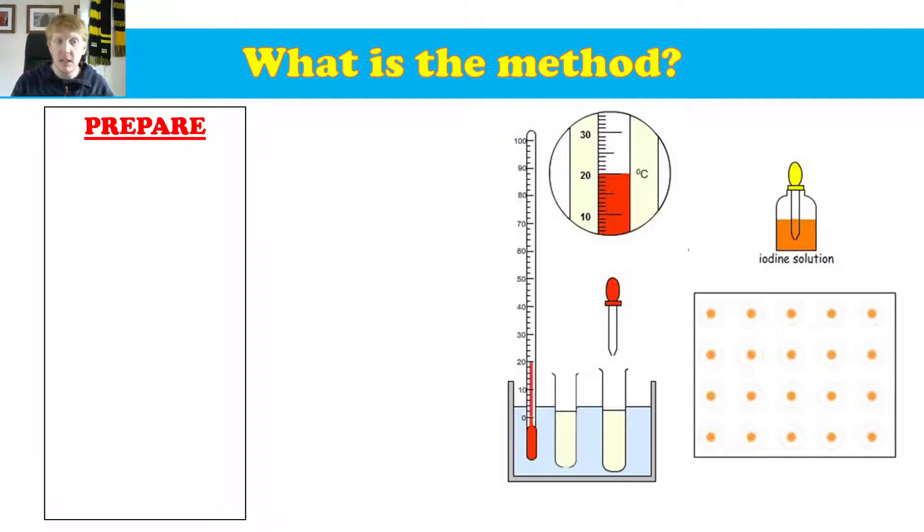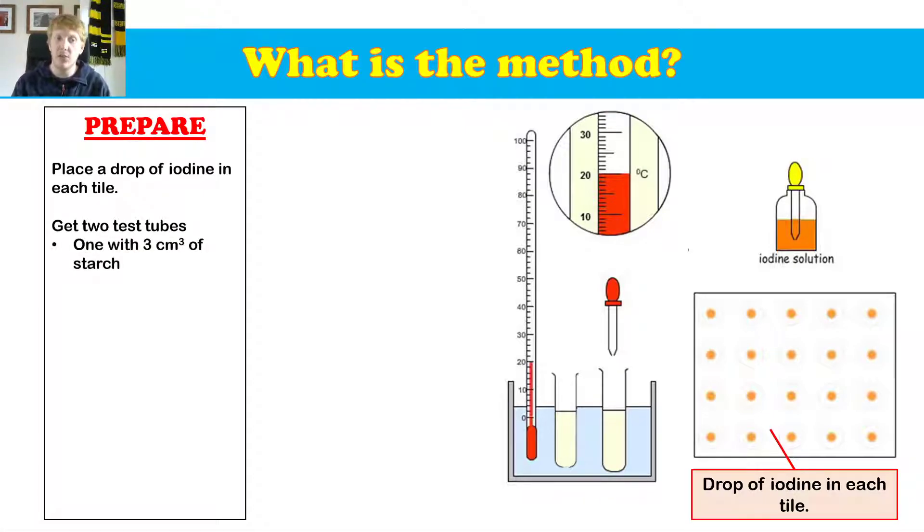So let's run through the method. Let's do the preparation phase first. So we're going to place a drop of iodine in each tile. As you can see on the right here, you can see my tiles, and we're going to put a single drop of iodine in each of those tiles.